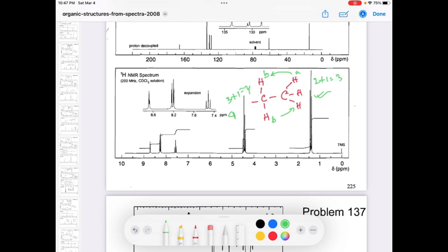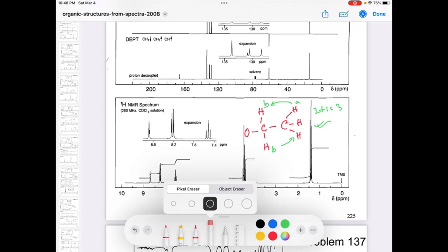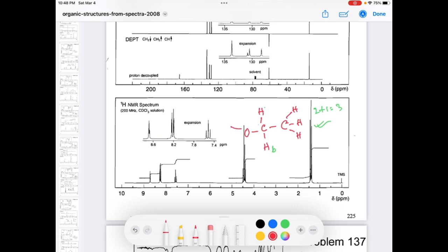So let's put that oxygen here. In that case, that oxygen will be with this carbon. So you have this group now. We have this carbon, that group, and since we are saying it is an ester, you can now include that carbonyl group to make an ester group. So this part is showing in the aliphatic region, like you have the triplet and you have the quartet, and the quartet is a little downfield, around 4.5, and that's why it is next to the oxygen. So only the carbonyl group hand is open.